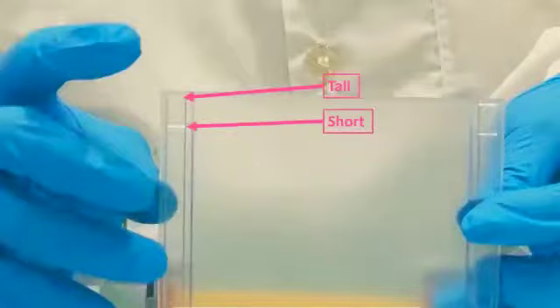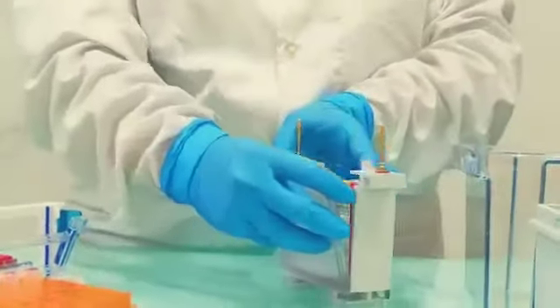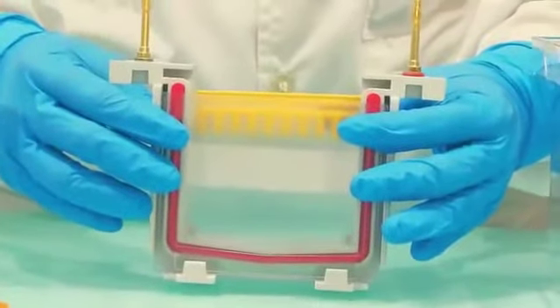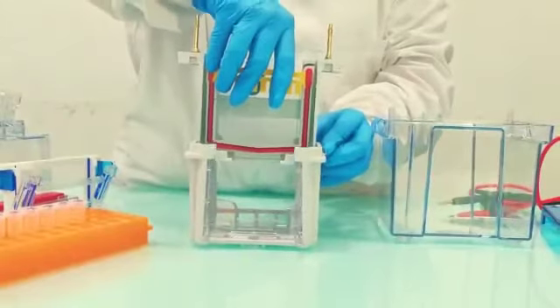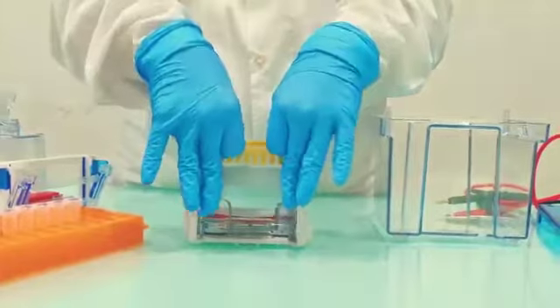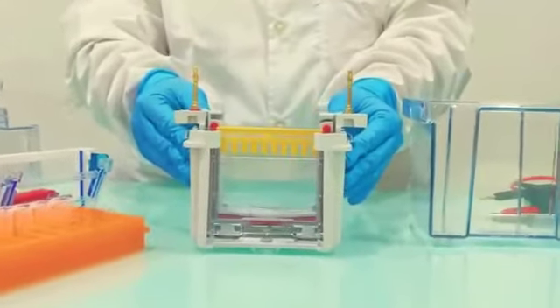If you look closely, you can see a short plate on the inner side of the gel. This side should face the electrode assembly. Once you are ready with this, place the electrode assembly in the clamping frame, and make sure you push it down while you clamp it together. Now place the whole assembly in the tank.